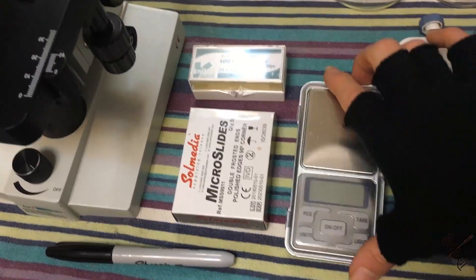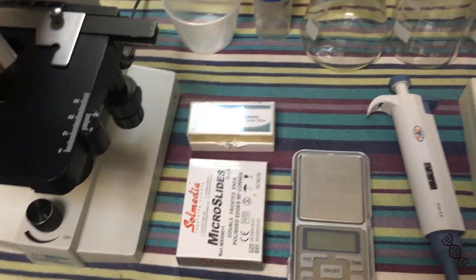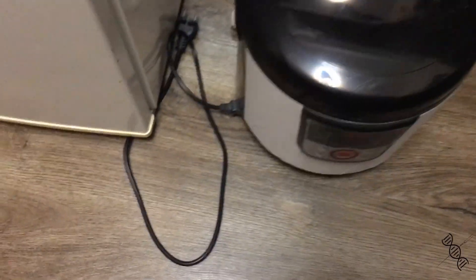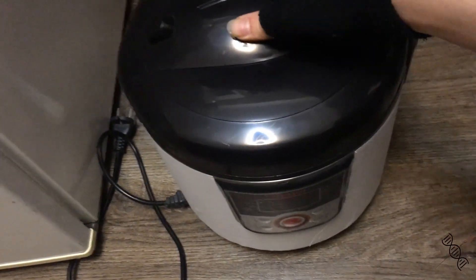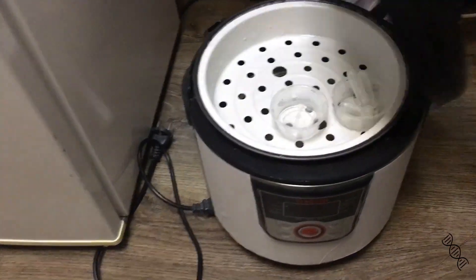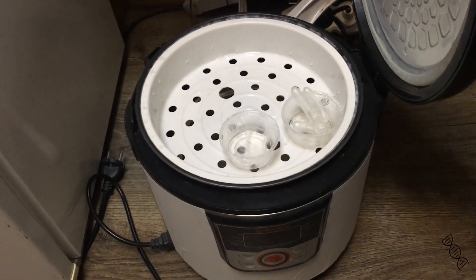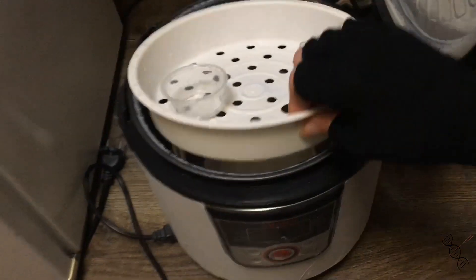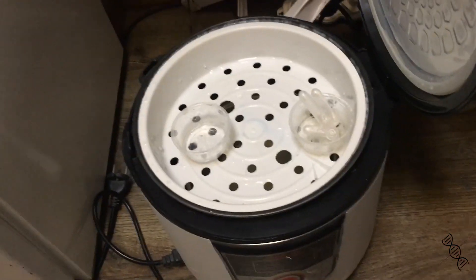Also, I have a scale — this scale is ordinary, literally every lab space has this one. It works pretty well but occasionally needs some taring and stabilizing. Here is my autoclave, my big boy — look at this, it's beautiful. Well, it isn't like a classical frequently-used autoclave — this is a pressure cooker. Normally it is used for making food, but a lot of people, not only me, are using it for biowork and sterilization of glassware and some plastics as well. So here is some water here — it boils the water and the steam makes everything dead inside.